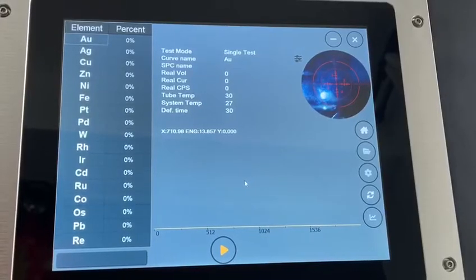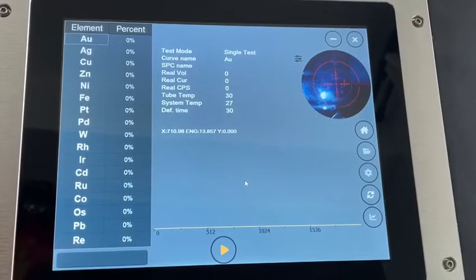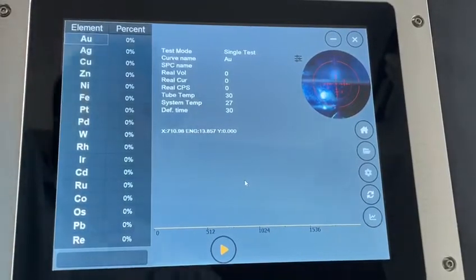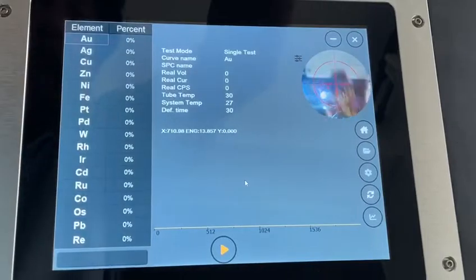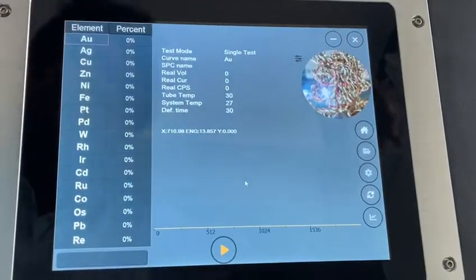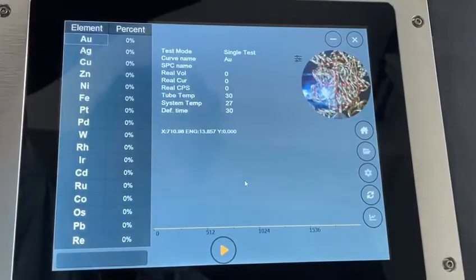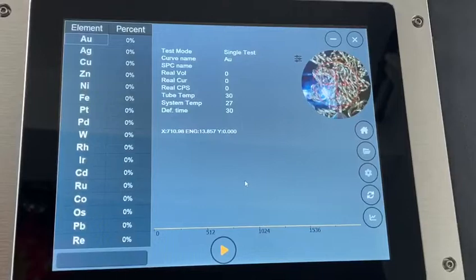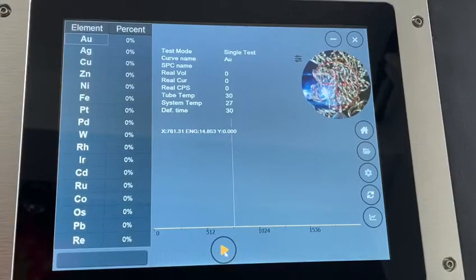Okay, I'm going to give you a little video about how to test a sample. Press your sample in your testing chamber, close the lid, and press start.